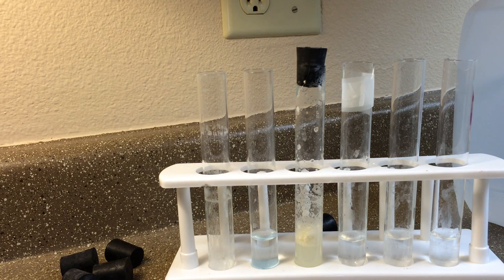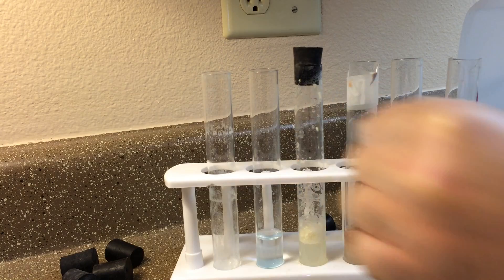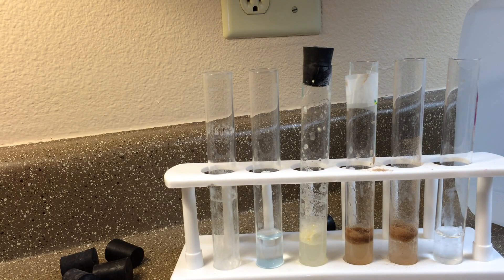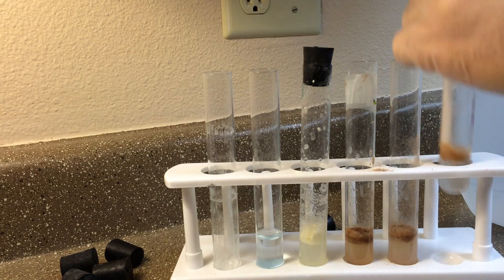We'll do five drops in there so you can see it'll actually turn purple. Then we're gonna put half a teaspoon of store-bought protein powder in this one, half a teaspoon of nutrition-shop-bought protein in the next one, and half a teaspoon of Whey Leaner protein in the very last one.